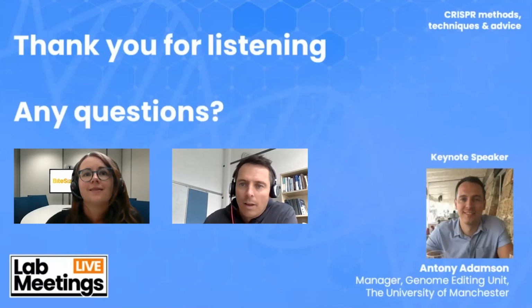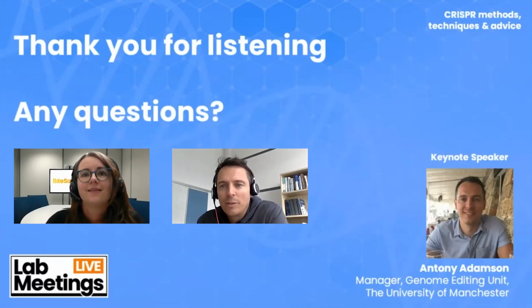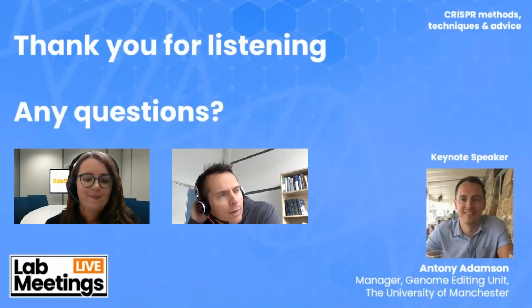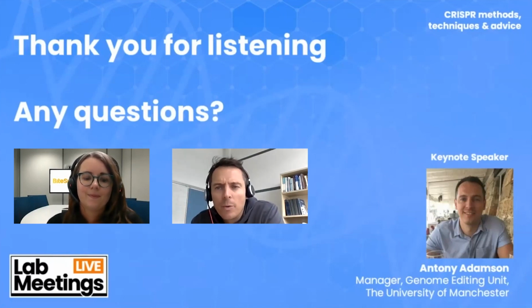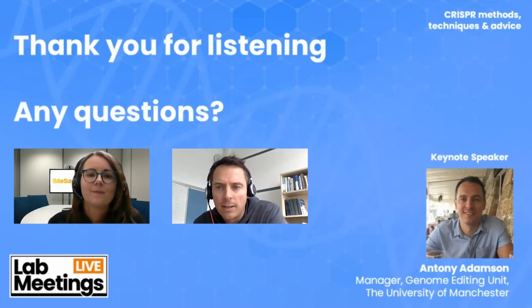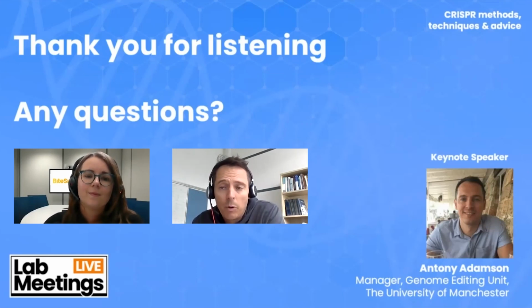Yes, but usually there's a way of getting it to work. It just requires more optimization. So things like THP1s, we had a bit of a nightmare with those. In the end, we had the nucleofection strategy where we had to really increase the concentration of the guide RNA and the Cas9. But ultimately, we got this to work successfully. To date, we haven't had any failures.